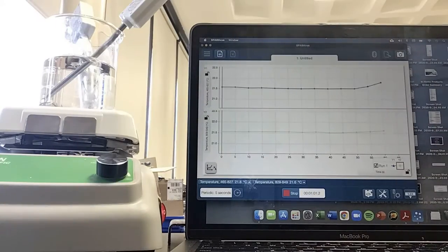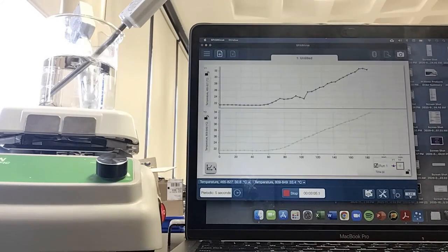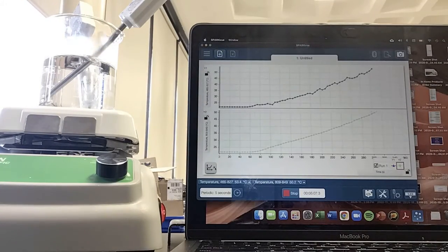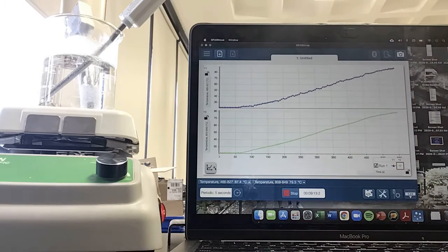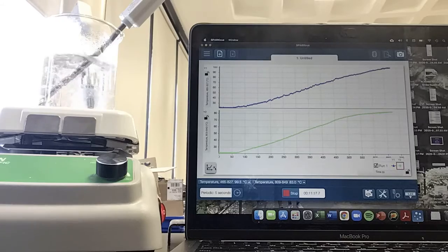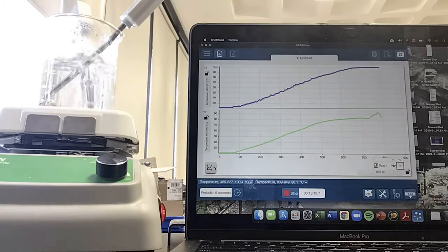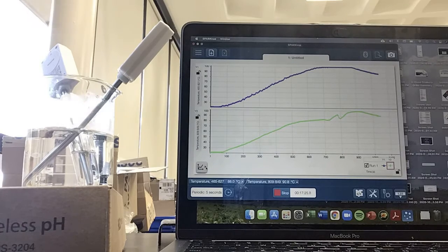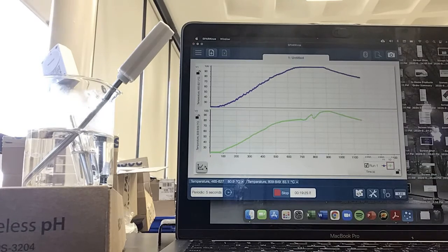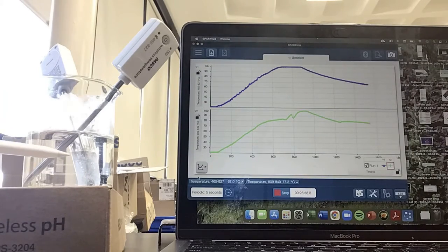Here's a time lapse of the melting and freezing experiment. We go through it and we can see that we're warming up a sample of an unknown substance on a hot plate. It melts at one point. We continue to heat it. We swap it over then and we let it cool. And it eventually will start to refreeze here, and we watch it go through the freezing process. And we're collecting data in both the water and the test tube throughout the process.